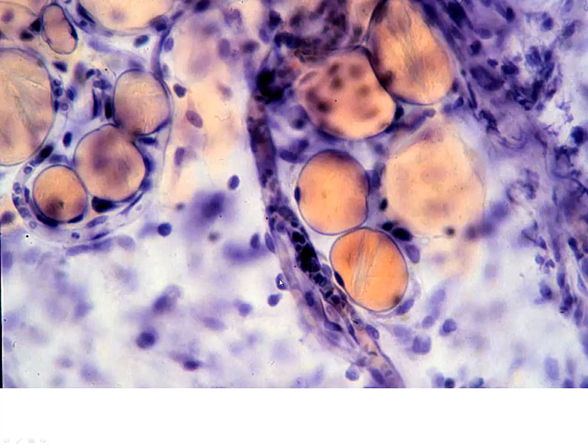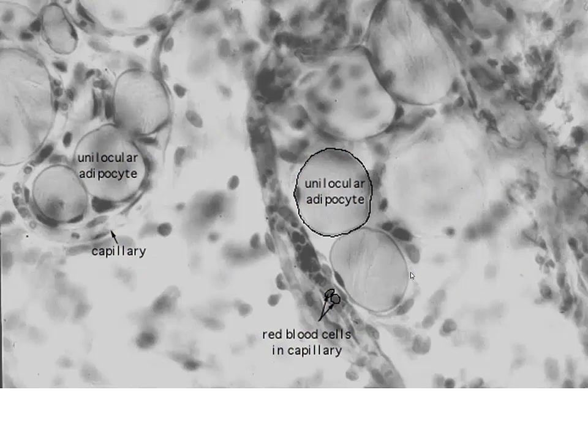We have some capillaries running through here. We can see red blood cells in single file. We can also see our donut-shaped red blood cells running through this capillary at this point. So we have white fat, adipose tissue, some blood vessels running through here. So a nice example of that type of connective tissue cell.